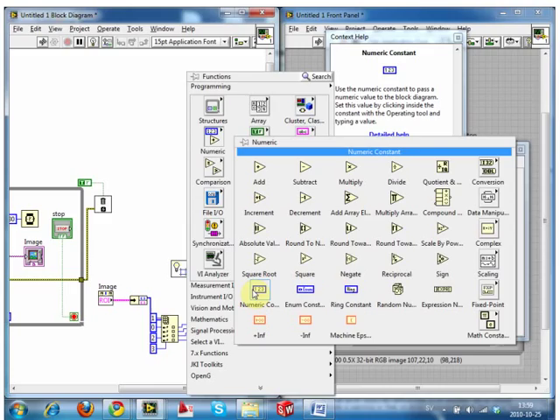If it's 5, it should be 0, 1, 2, 3, 4. Just set the start number. It doesn't start from 1, it starts from 0. But you already got one, so you have to start from zero. Because that should be 1. So X1 right now is wired into the 1.